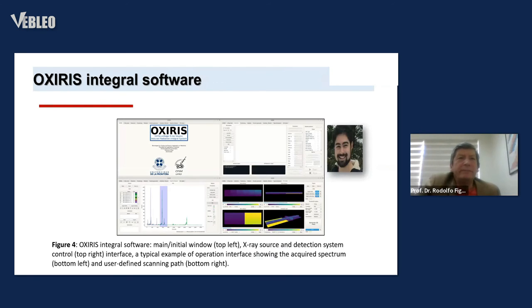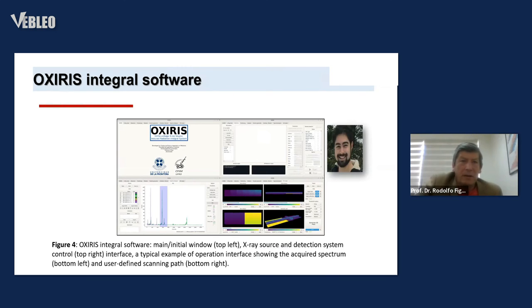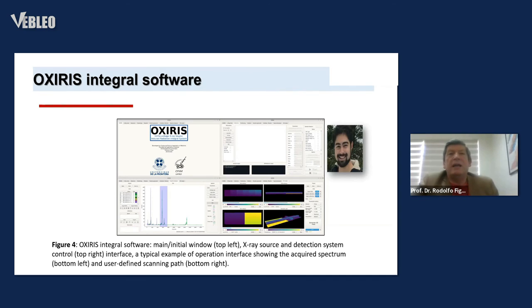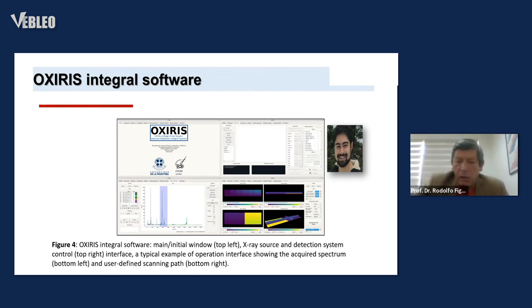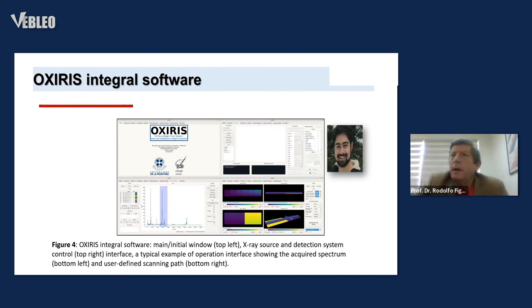The OXIRIS integral software — main interface showing the control system and detection system. A typical example of the operation interface shows the acquired spectrum and user-defined scanning parameters. This is the control software for our project, with Brian as the main contributor to this part of the project.